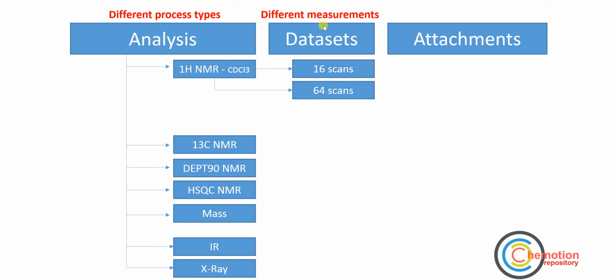The decision if the data needs to be added to a new dataset of an existing analysis or should be placed into a completely new analysis is not straightforward. A general rule may help. If the description in the analytical part of the analysis changes with the additional data, then one needs a new analysis tab.